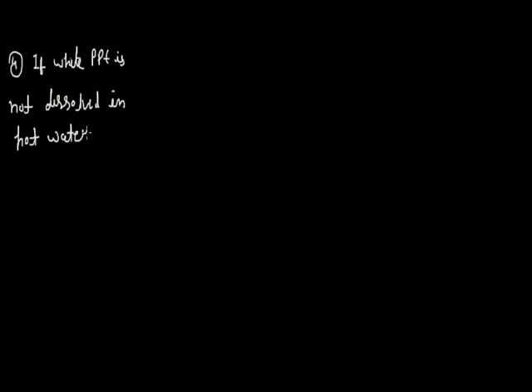But if the white precipitate is not dissolved in hot water, then this indicates that this salt does not have Pb2+.